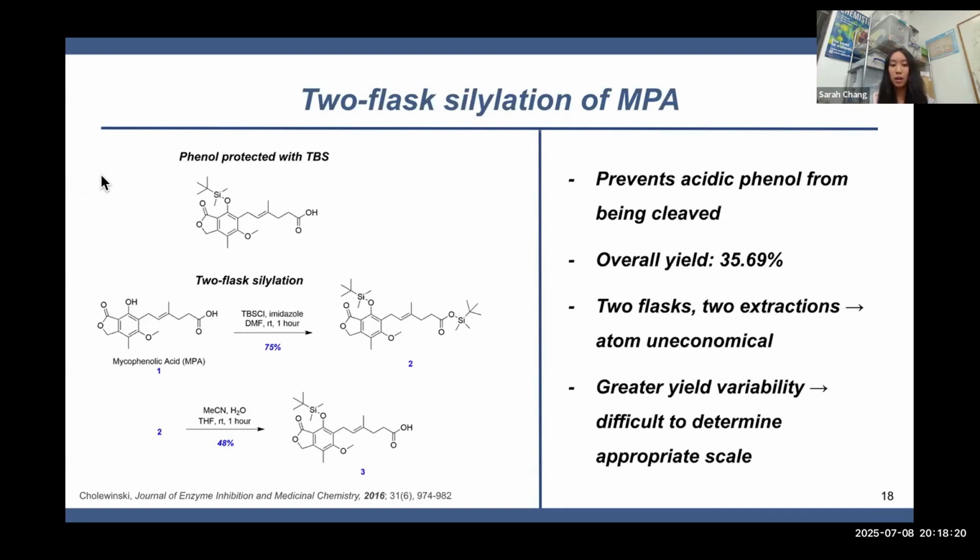While it may not be apparent to those of you who are not synthetic chemists, the larger strain in large-scale chemical processes, such as early-stage protection, is not the reagents but rather the solvents. As we purified our reaction mixture two times, we used about a liter of solvent per gram of material produced.